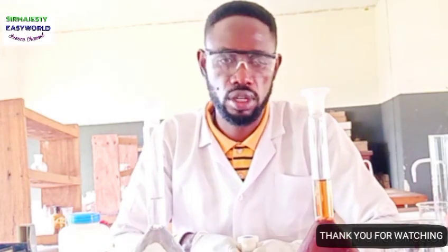So what must we do in this case? Join me in that live stream. The equations, how can you predict the endpoint? This time around, you do your titration. Join me and I'll tell you the precautions you take and how to fill your report form. Then for likely questions and the solutions to the likely questions, I will also discuss them in the live stream. So if you have any other question, bring it alongside.